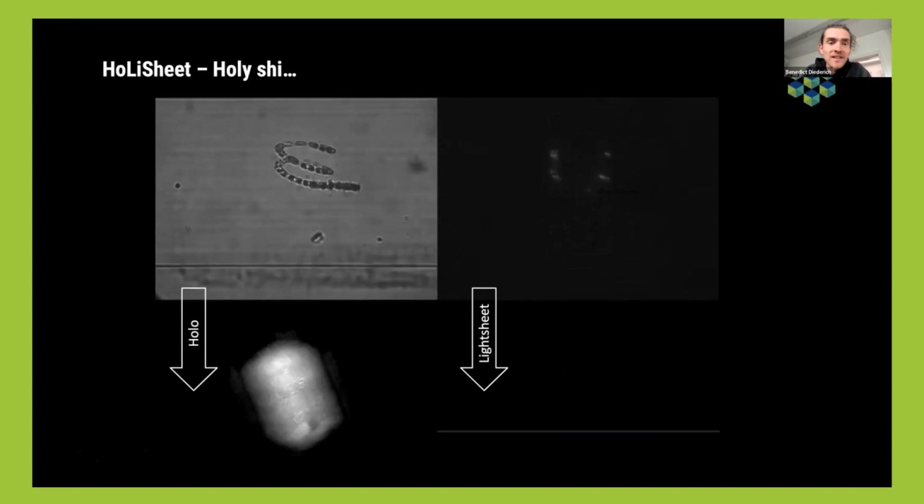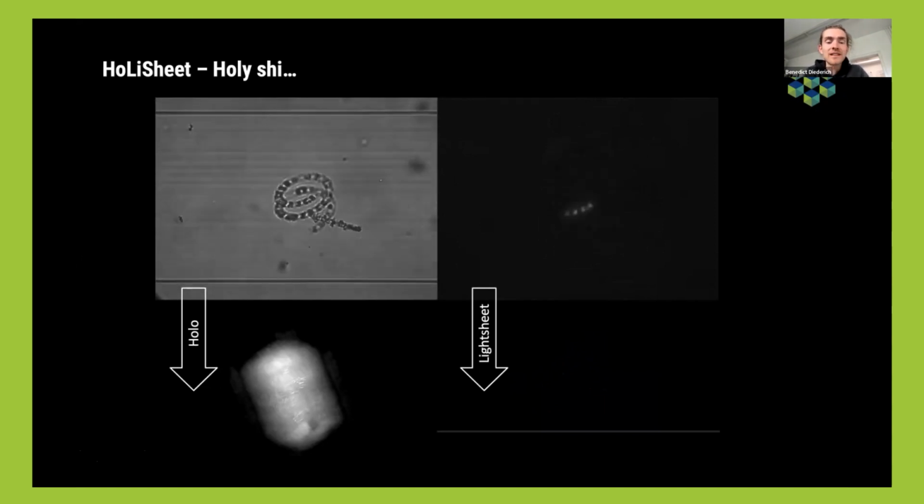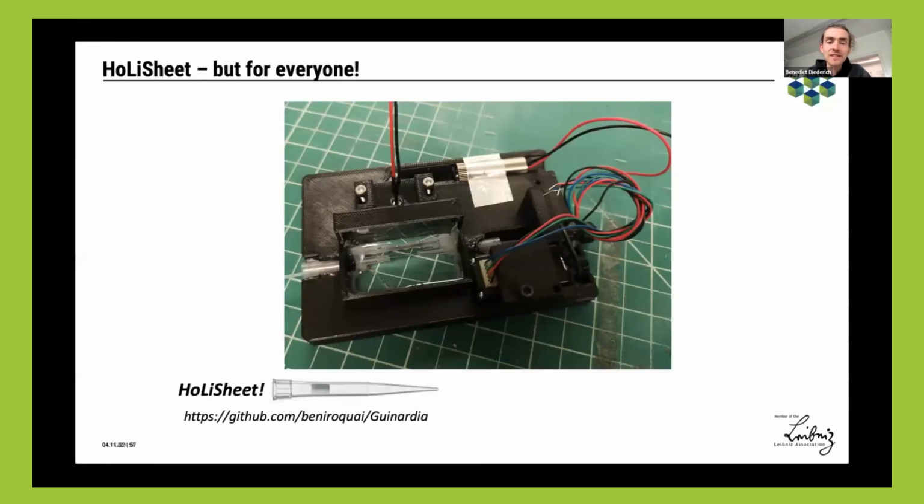And the cool bit here was that the rapid prototyping aspect was nicely used, and in the end we were just able to derive the whole system. It was important to use, for example, pipette tips as bearings because they seal and they are really straight and cheap.